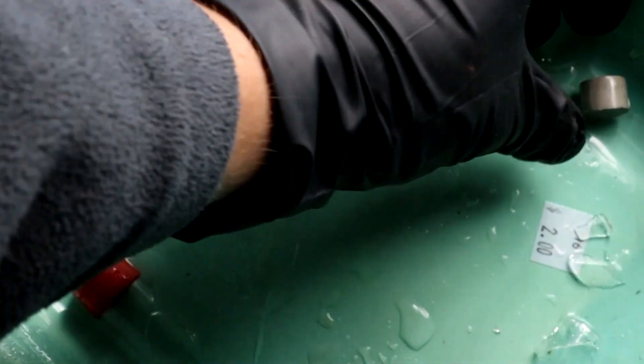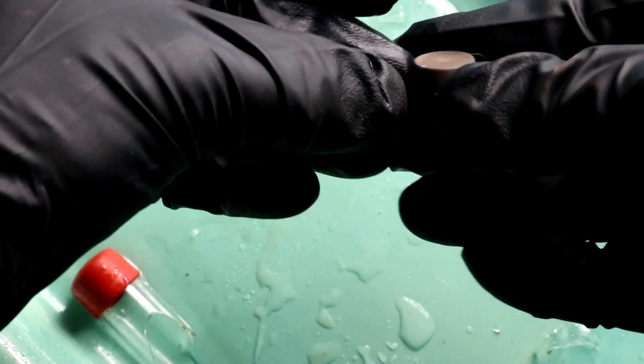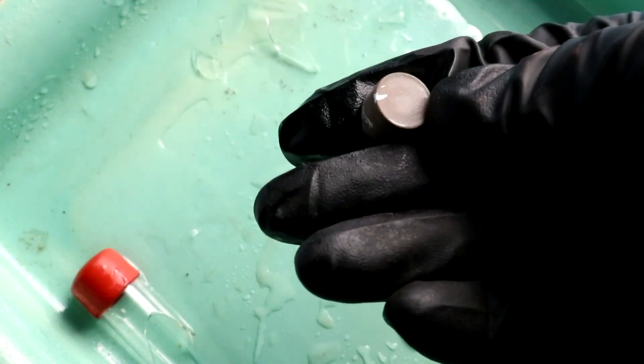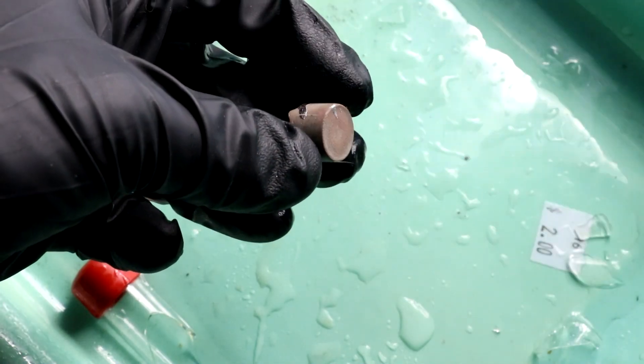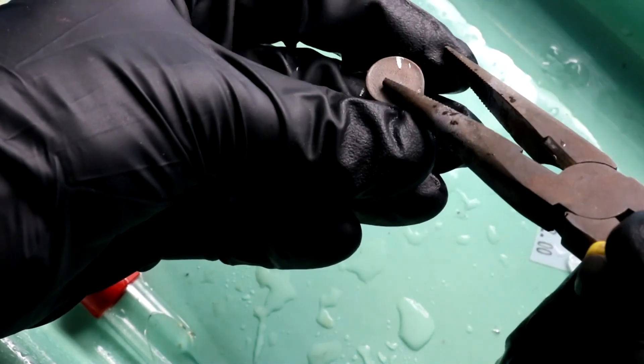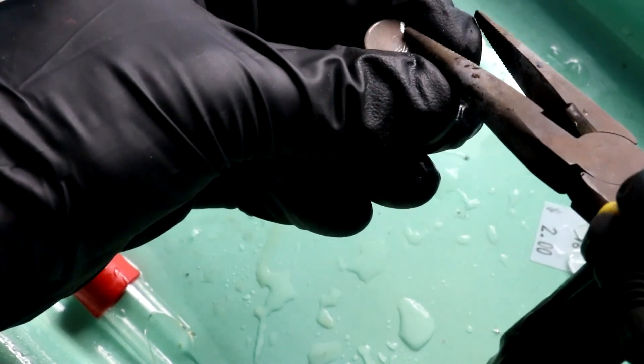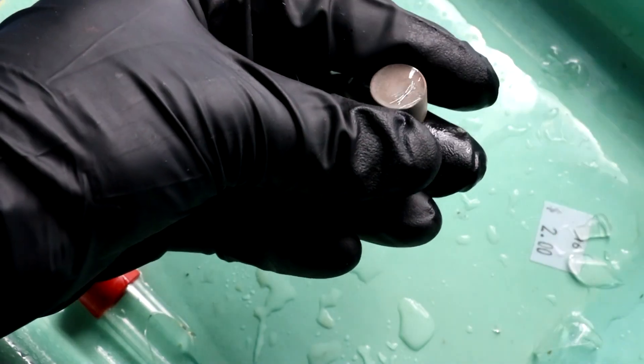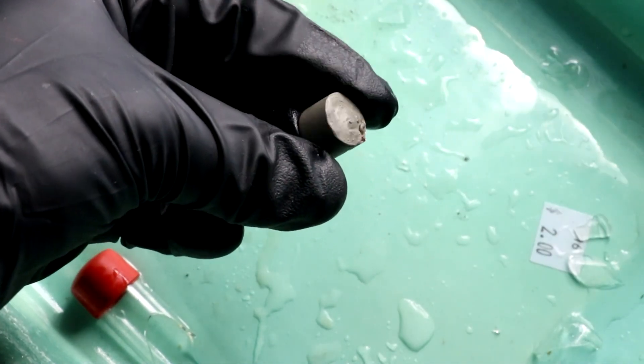There it is. Solid chunk of mercury copper amalgam. It's a little bit oxidized. That's the copper doing the oxidizing. But if I scrape at it you can see it is still shiny. Also quite hard. Just a little bit of copper makes it a solid at room temperature.